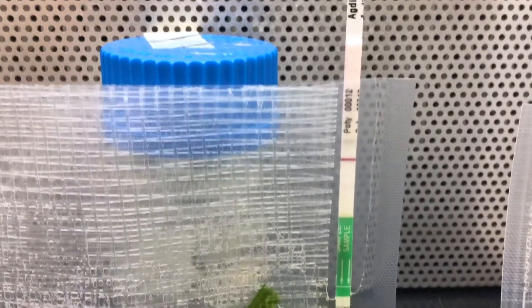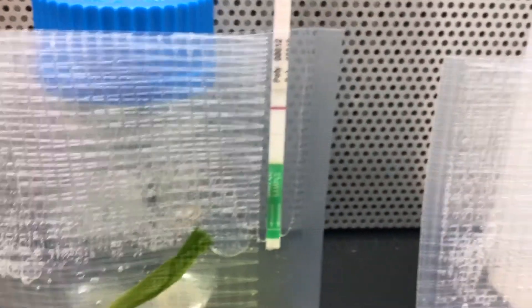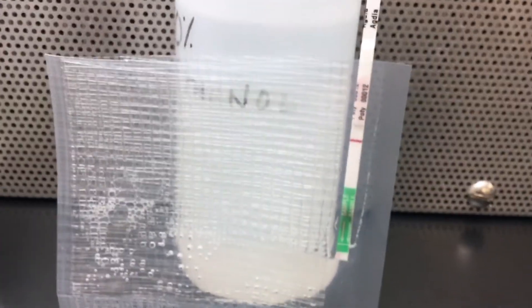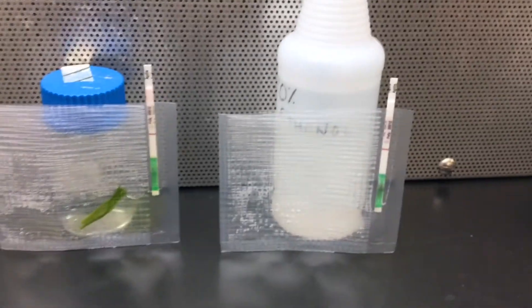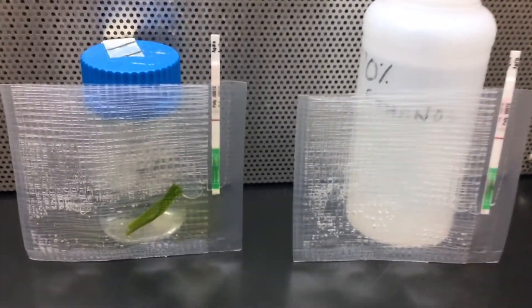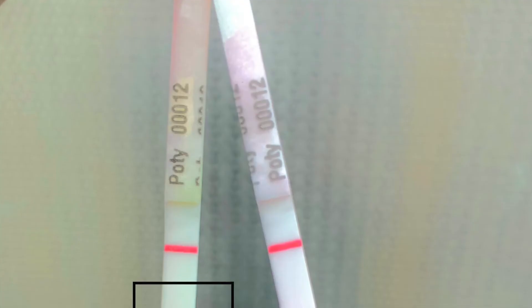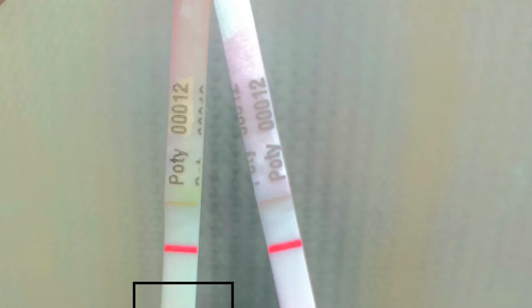After 30 minutes, you can see the upper line or control line clearly, even in the buffer-only test. But you are going to do only the test with the plant sample. I did this to compare between positive and negative results. If we see both the upper control line and the lower test line clearly, that means your sample is positive for the virus.